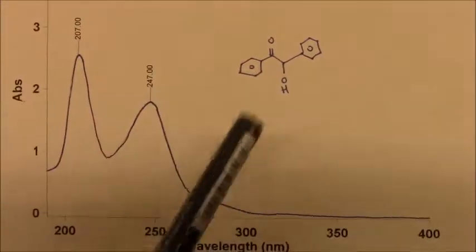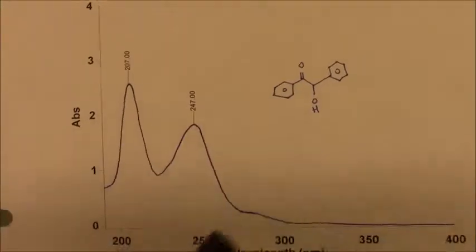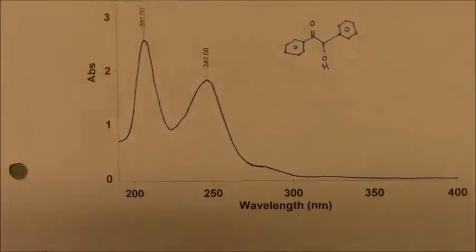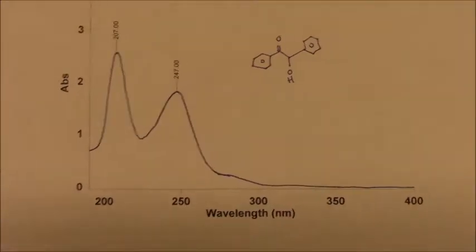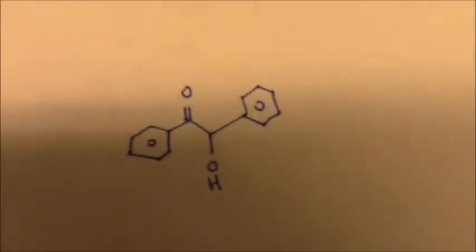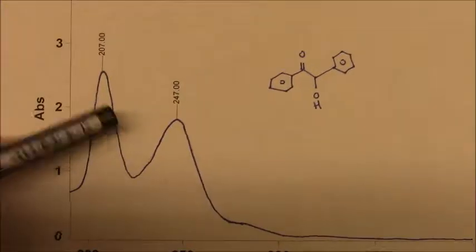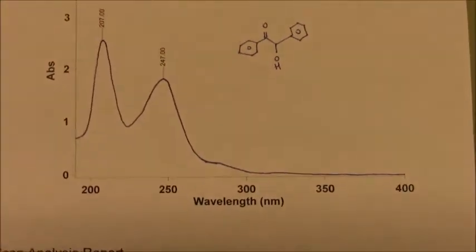So the purpose of the UV is simply for you guys to get used to more software, and get used to what the ultraviolet spectrum looks like. Assigning this, you can't say much other than arguably if you have an aromatic ring or any pi bond, you're going to label the strongest peaks as some type of pi to pi star. That's about all we could say.